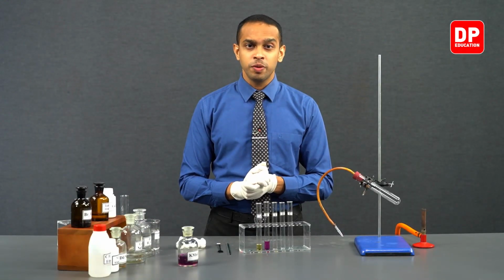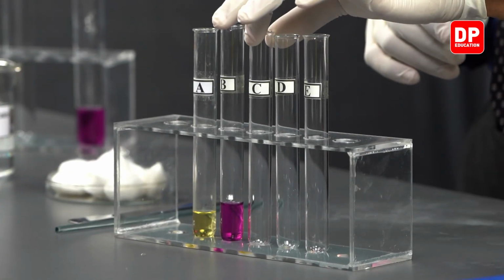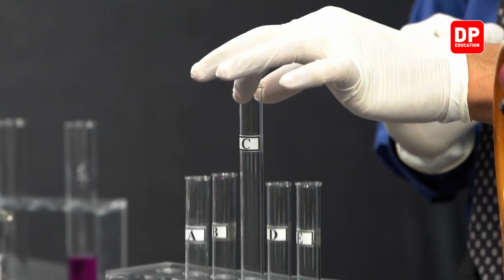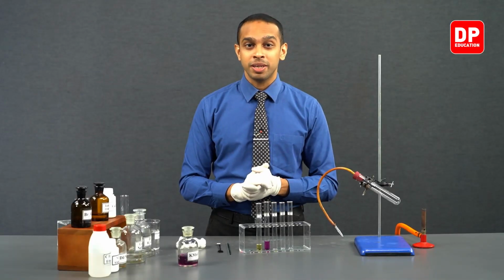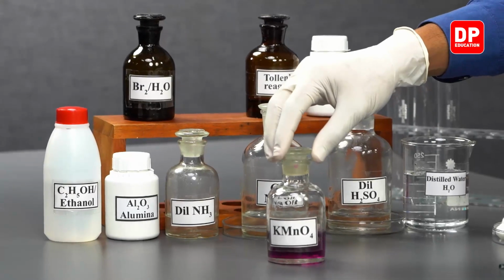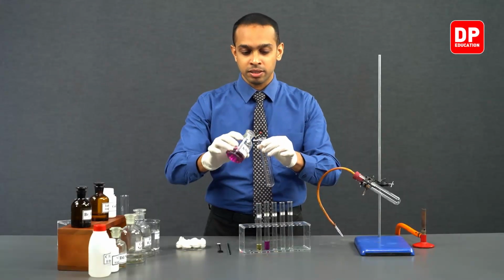Now we will be moving on to our test tube C. As I mentioned earlier, test tube C should contain acidified potassium permanganate. So let's prepare a small sample of acidified potassium permanganate. Let's take another boiling tube and take a small volume of our dilute potassium permanganate solution here.